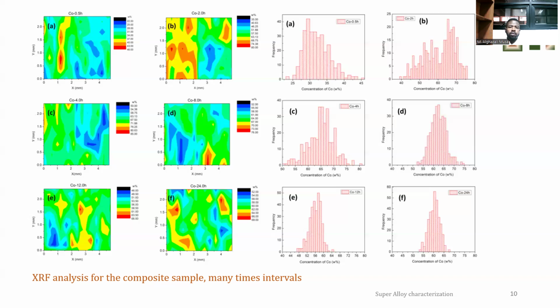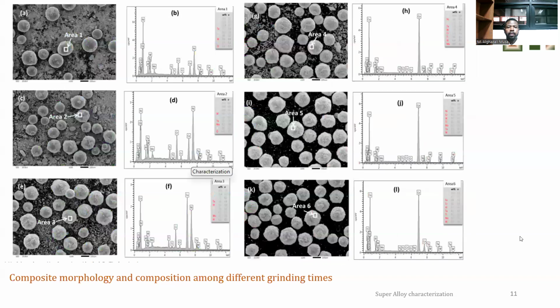Yeah. So the other thing, firstly, characterization in this domain, and actually, it's like this. It's a 2D domain. So the scanning is 4 by 2 millimeter. So it's a very wide area actually for detection. So okay, also for confirming the homogeneity of the created pellets.